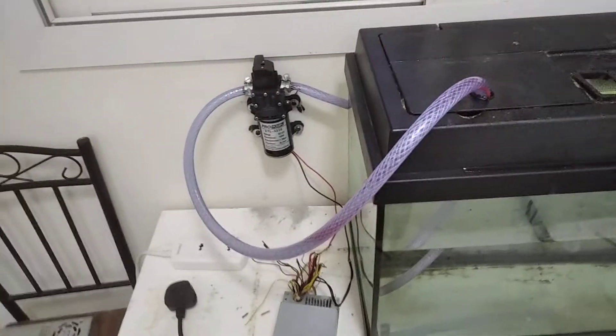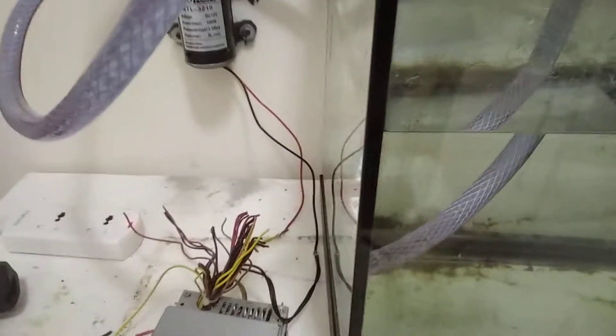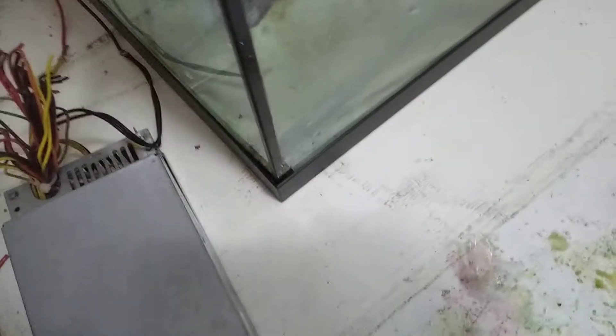Here's my new vacuum aspirator setup. So that's the intake — it's facing the walls so bubbles don't come in. This is the outlet. This is the pump. And this is the power supply. I'm going to power it up.